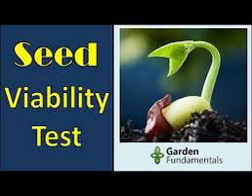Remove the seeds with clean forceps. The water left is known as leachate. Warm the electrical conductivity meter for 30 minutes. First measure the conductance of distilled water. Clean the electrode with tissue paper and measure the conductance of the leachate. Actual EC of leachate equals EC of leachate minus EC of distilled water. The lower the EC values, the higher the vigor of seeds.